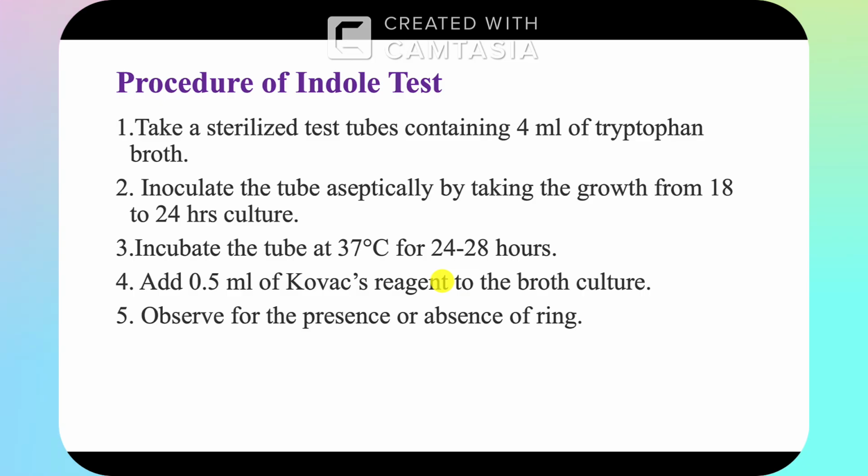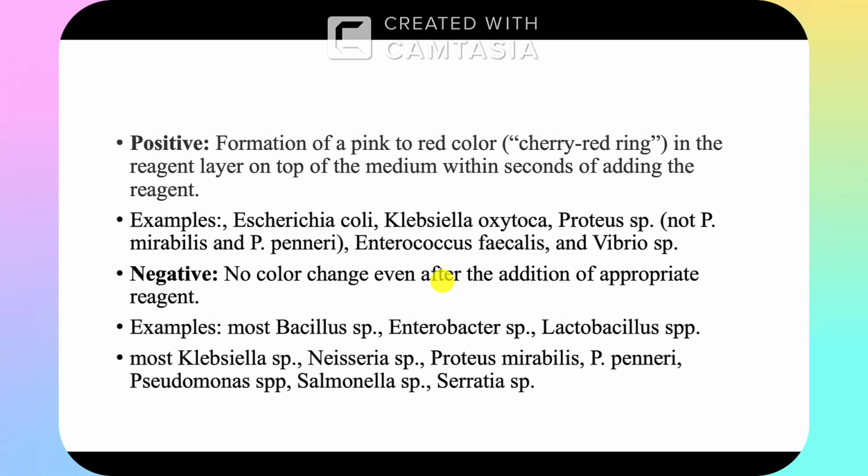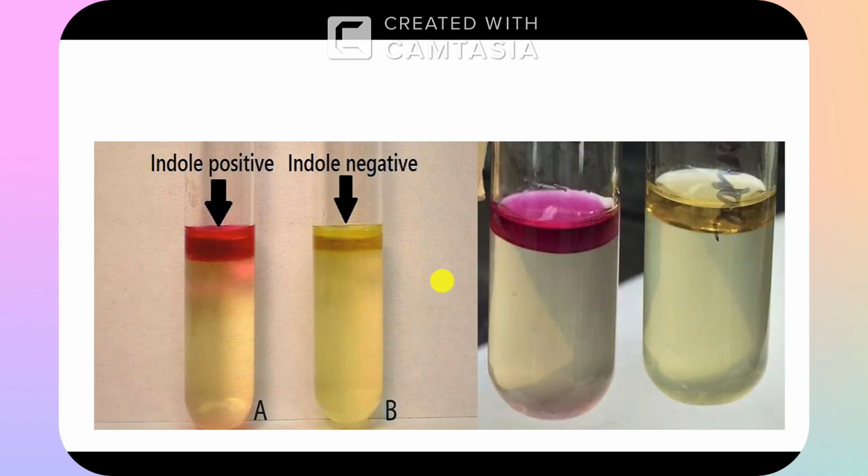In this nutrient broth, we have E. coli inoculated in the media. This is a tube which contains nutrient broth, and I do the inoculation of E. coli in this media the day before the test.